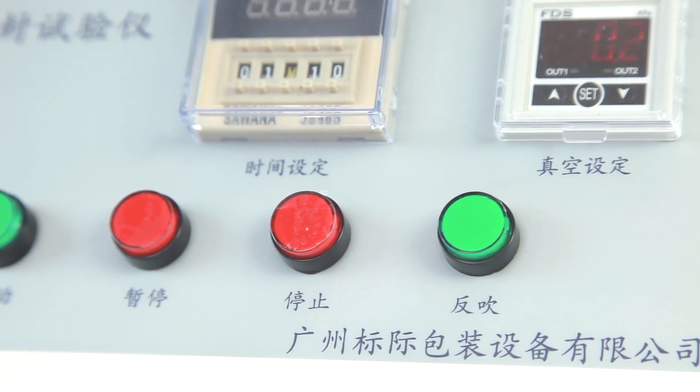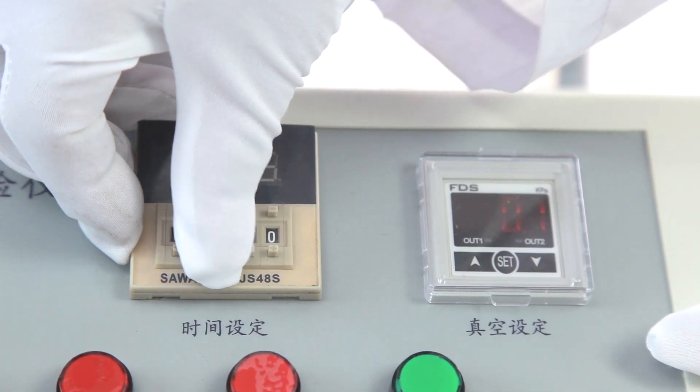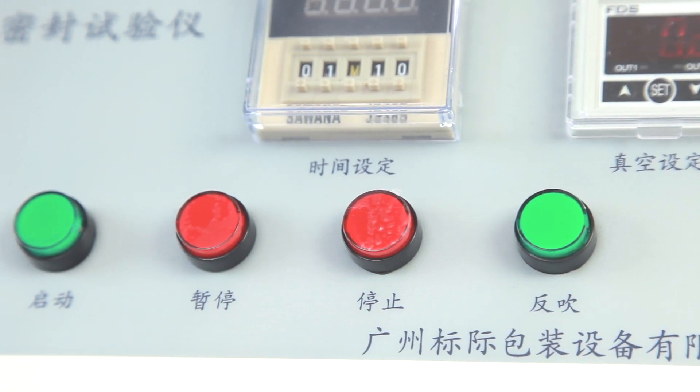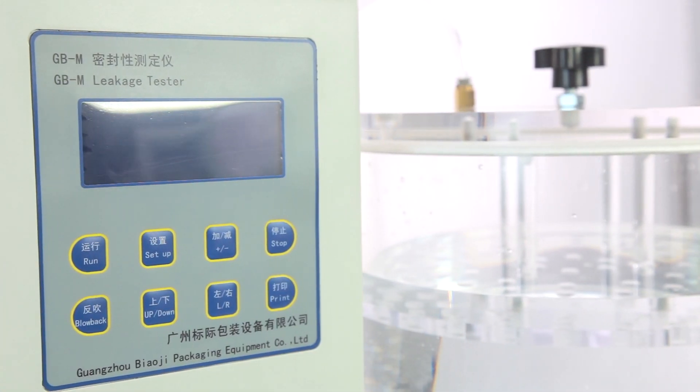GBM uses compressed air as drive force and uses a vacuum generator to create vacuum. It can set parameters with fast speed and high precision, automatic running according to specified vacuum degree and time, automatic stop, and automatic return.